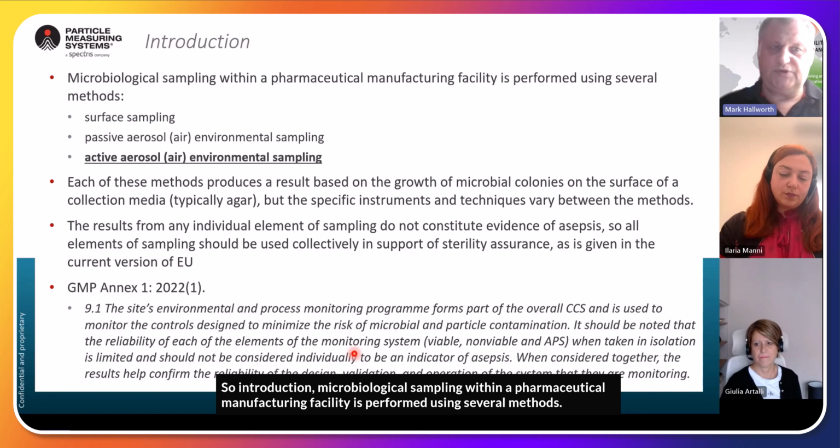And it's saying, no, you have to look more holistically at whether or not this is demonstrating a shift from control to out of control. And it could be that your data is spiky, and with microbial monitoring, we've got this statistics of small numbers where even a single growth in a grade A environment requires an investigation. And it's in that investigation, where do you go with it?